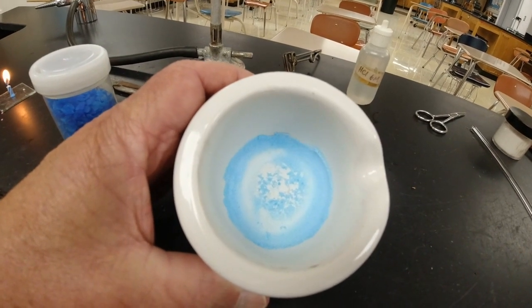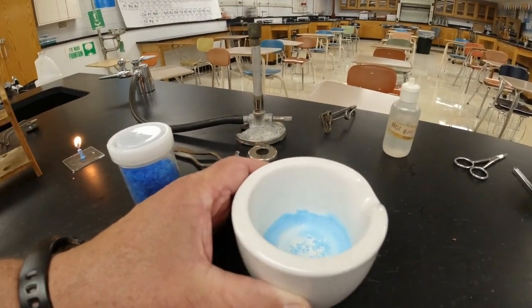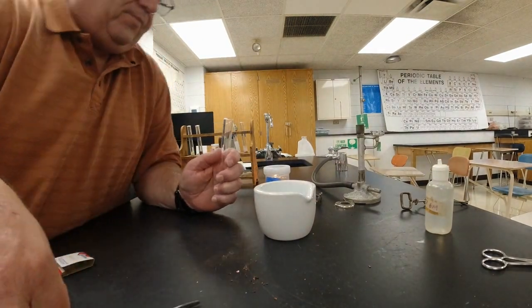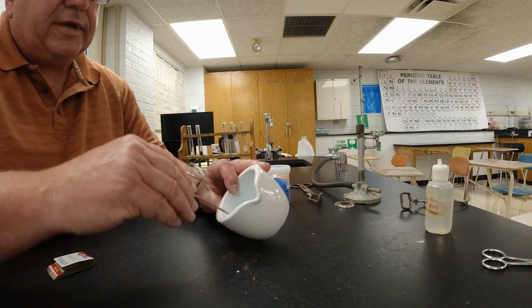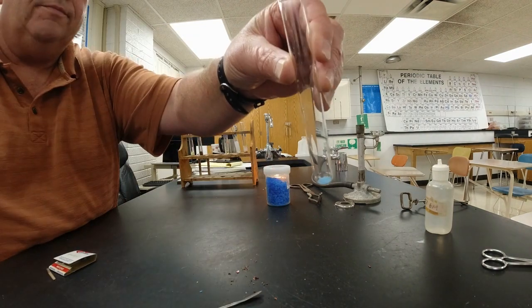All right, so what I'm going to do next is I'm going to put a little bit of crystal in a test tube. So I'm going to take this powder and I'm going to put it in a test tube here. So I'm going to get some of this so I can get this down here like this. That's in there. All right.